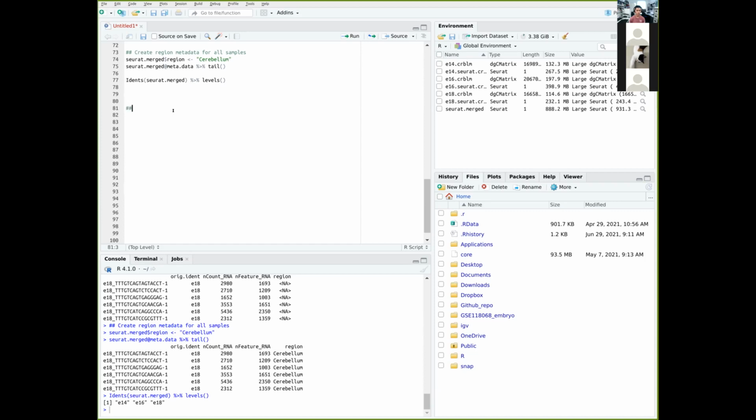So this is now in part, I think I lost count, should be part 4. My script says it's part 4, and it's quality control of our data set. And this is very important because you want to have a feel of the overall quality of your cells.